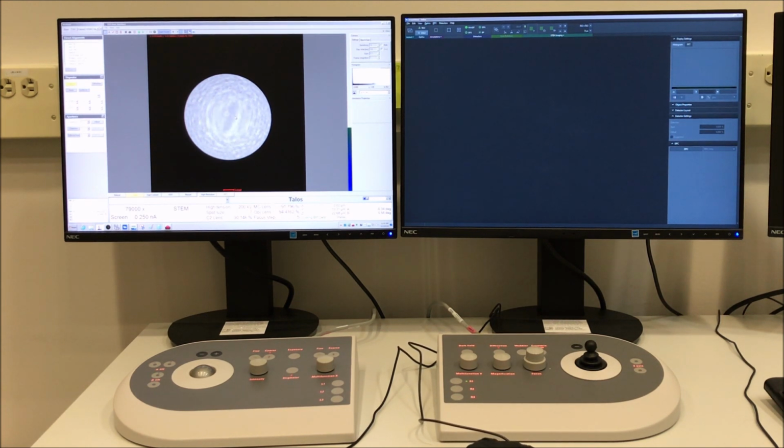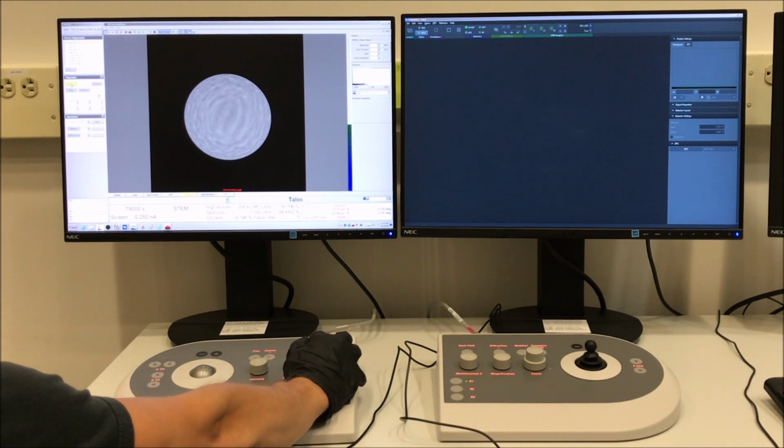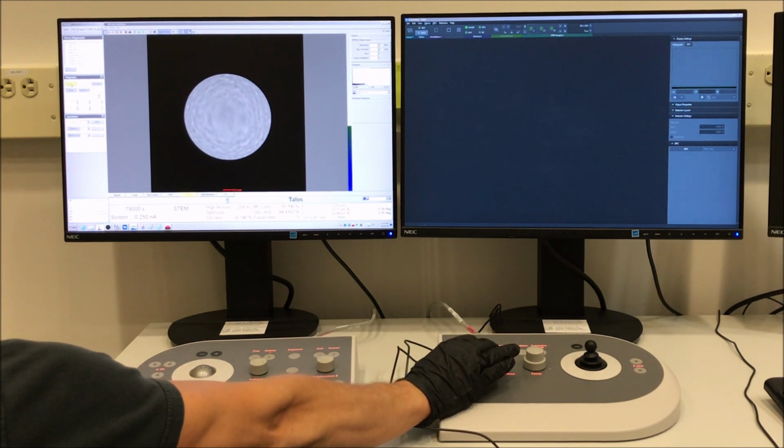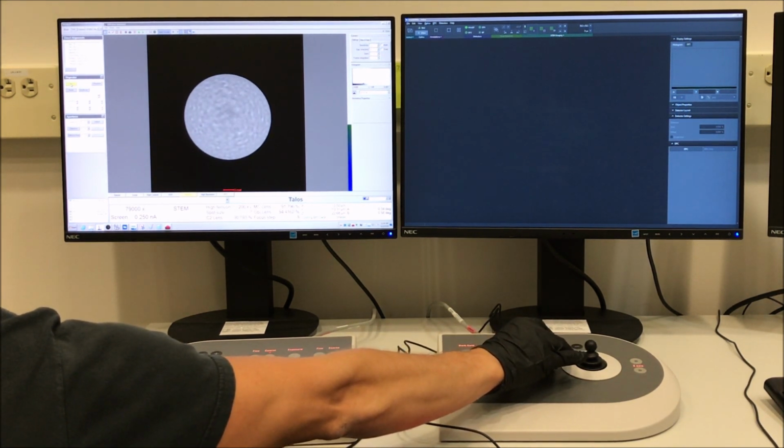And then I see that my Ronchigram features are not quite circular, so I'm still in the Tune tab here. I'm going to make a quick adjustment to my FluCam exposure, drop that down to 50 milliseconds. Go to the Stigmator panel in my Tune tab, use my multifunction knobs to make the features circular. Next thing, of course, is the rotation center.